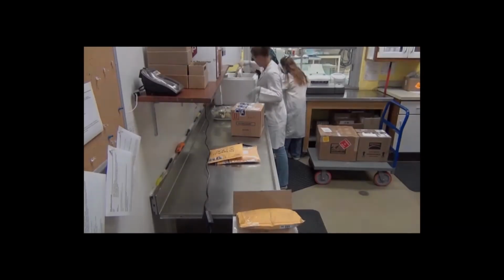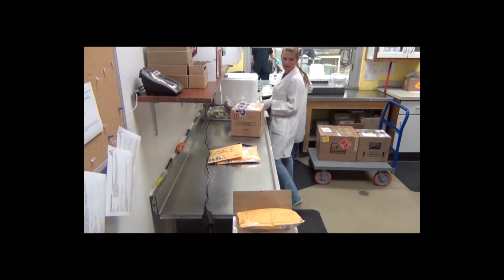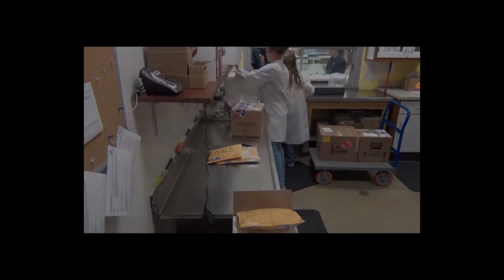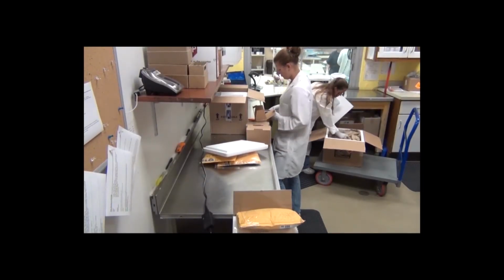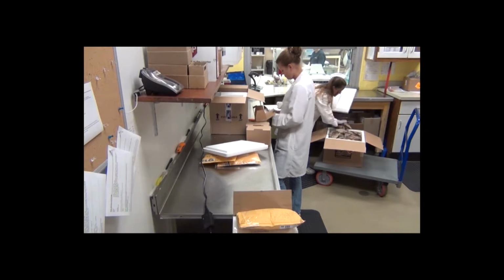Each box is unpacked and checked to make sure the proper samples and paperwork are included. If there is mismatched or no paperwork, leaking or improperly packaged specimens, or animal IDs not provided, this case is set aside to be dealt with later. Usually a phone call to the practitioner needs to be made to fill the gaps in knowledge of missing information. Once again, you can see how properly submitting your samples accelerates the process and helps you get timely results.